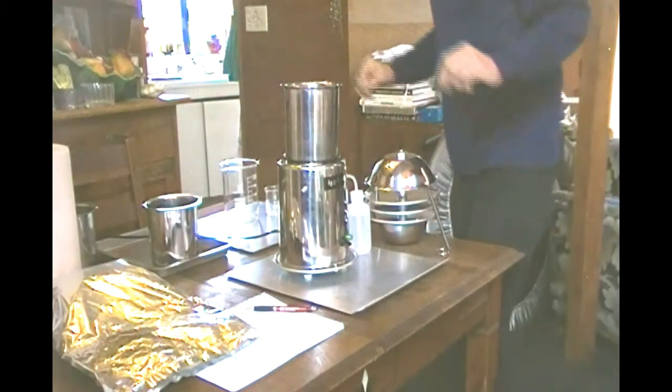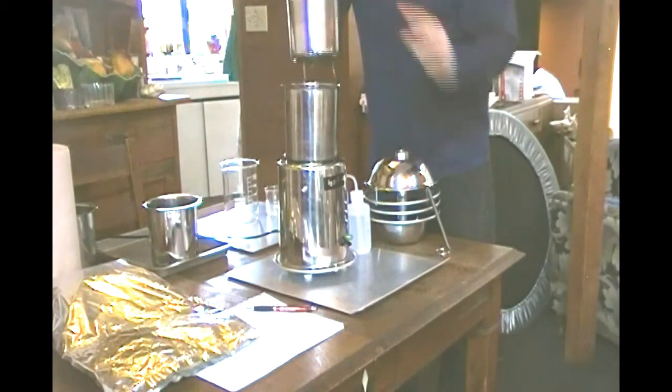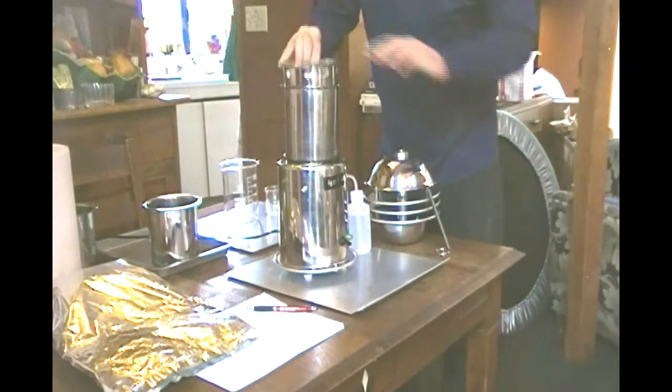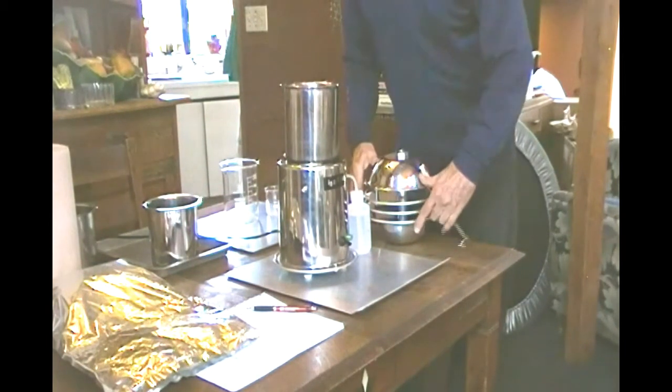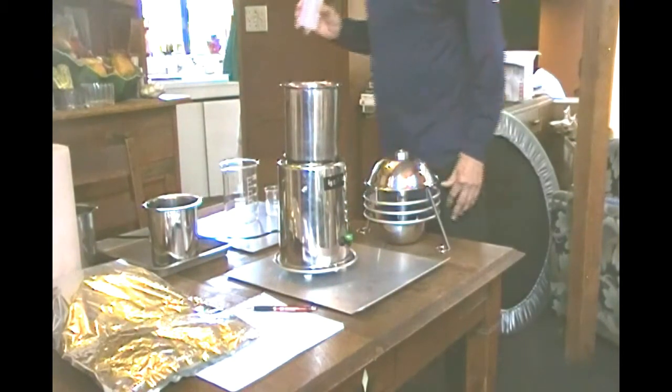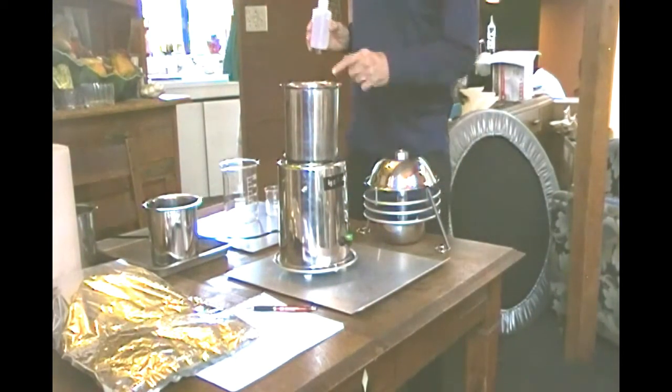Now I hear it dripping through. I check this. It's coming out nicely. It's looking like about 1/2 to 3/4 of an inch in there, which is exactly what we want. So, the next step, we take the condenser. This I'm moving away. This is our washout alcohol. We don't want this near the machine.